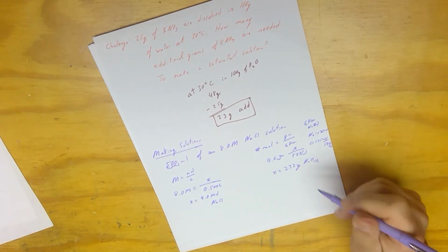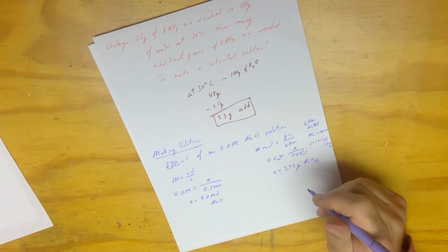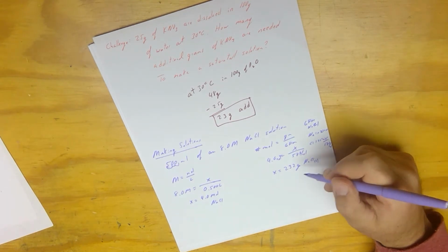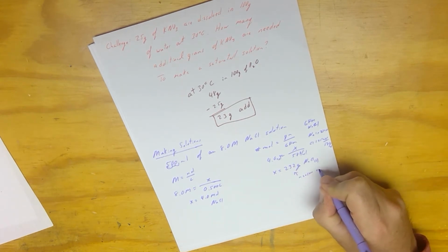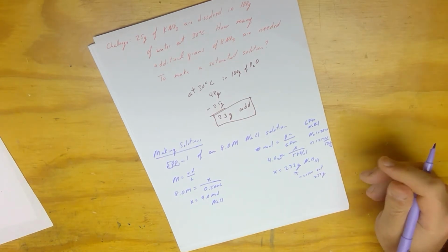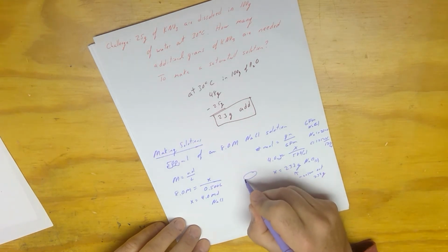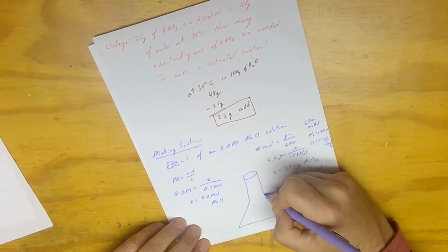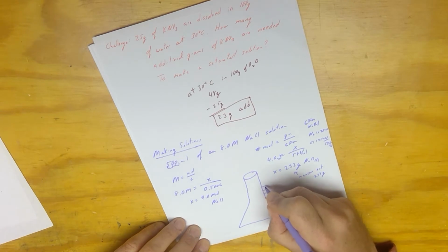So now, if I was actually going to make this solution, I would go over to one of the electronic balances. I would take my NaCl and measure out 232 grams. Then what you need to do is take a graduated flask, like an Erlenmeyer flask. It's got to be graduated. By that I mean it's going to have your volume marks.